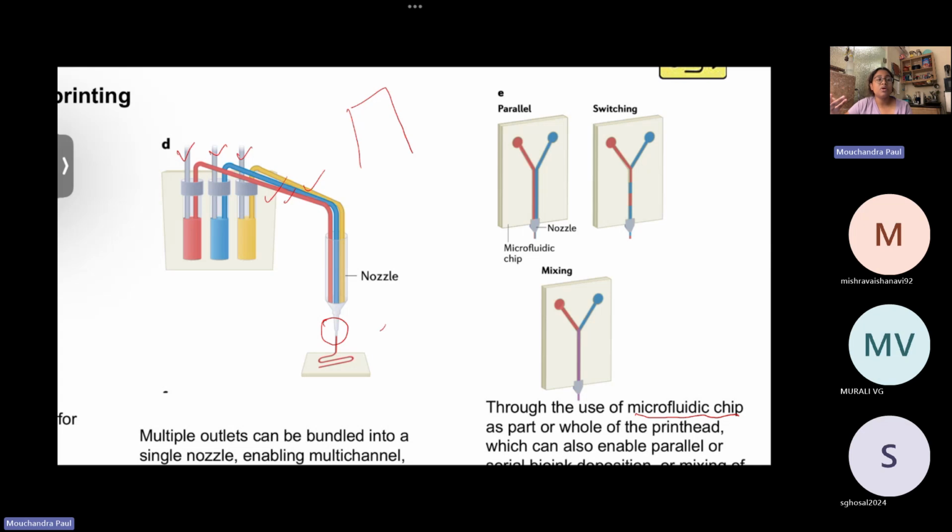Common sense says that since it is very tiny, within the range of micron size, it will only support laminar flow of the fluid through it. So even if you use very high pressure, you won't be able to see any turbulence in the flow of the fluid. That is why microfluidic or micron size channels are preferred to ensure laminar, smooth flow of the material.